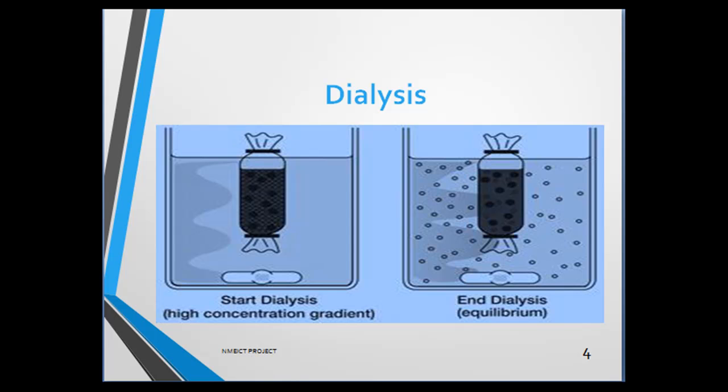Dialysis is based on diffusion of molecules in solution from higher to lower concentration until equilibrium is reached. Movement of molecules across the membrane will be based on membrane cutoff. Larger molecules cannot pass through the dialysis bag and will be retained inside the chamber. In contrast, small molecules will freely diffuse across the membrane and obtain equilibrium across the entire solution volume, thus effectively reducing the concentration of those small molecules within the sample.